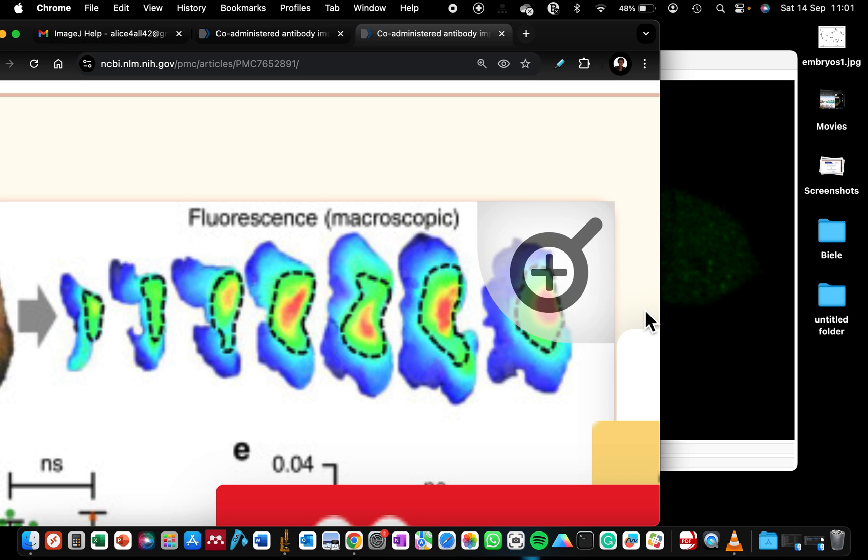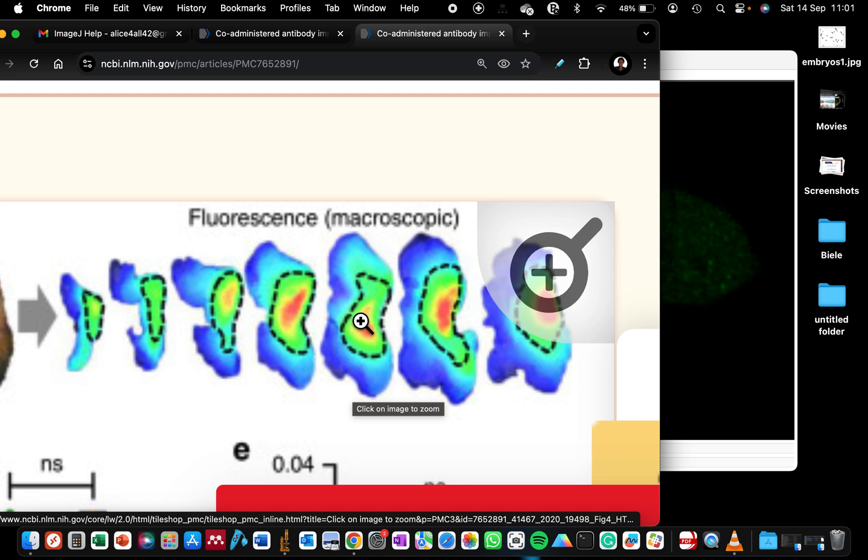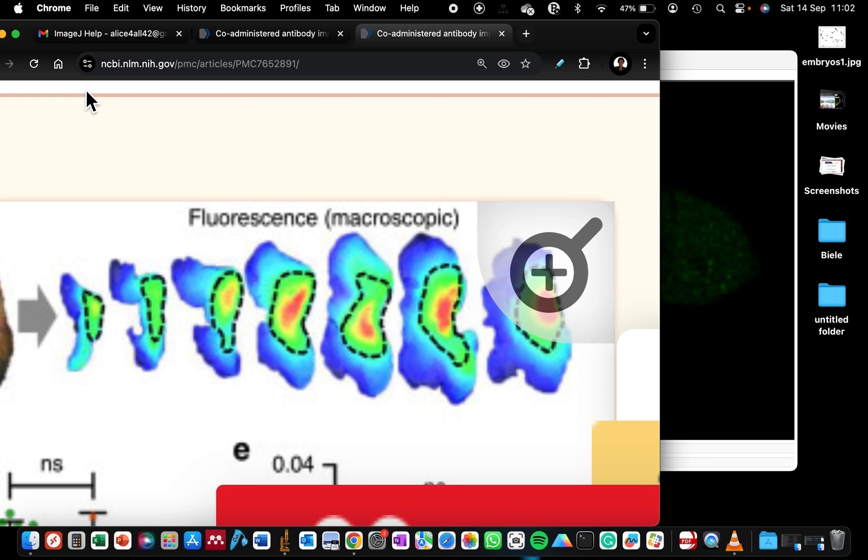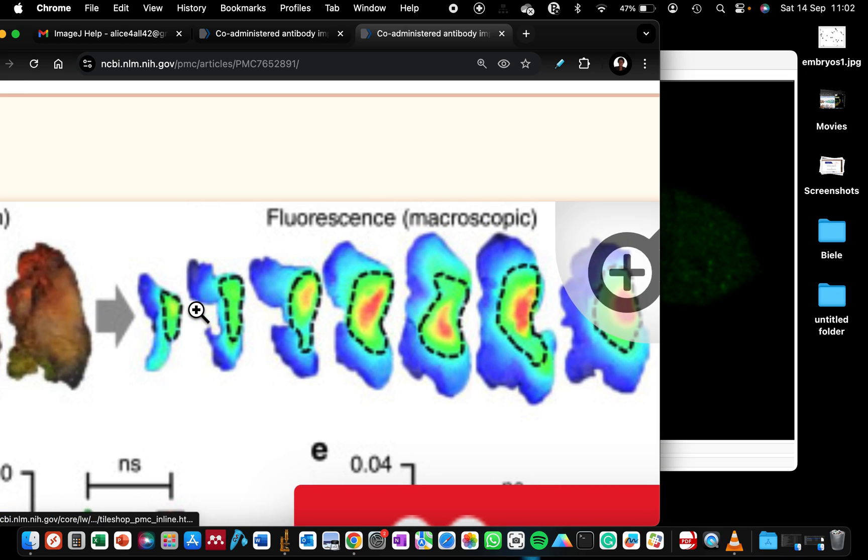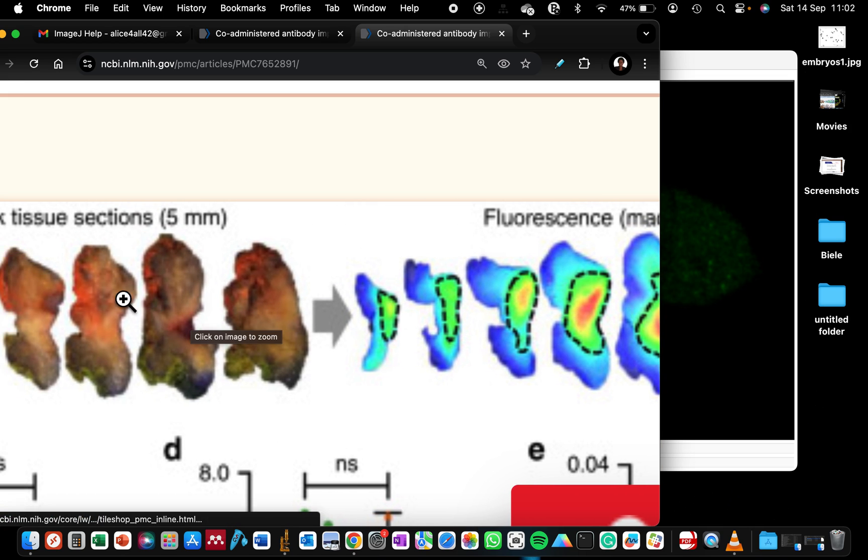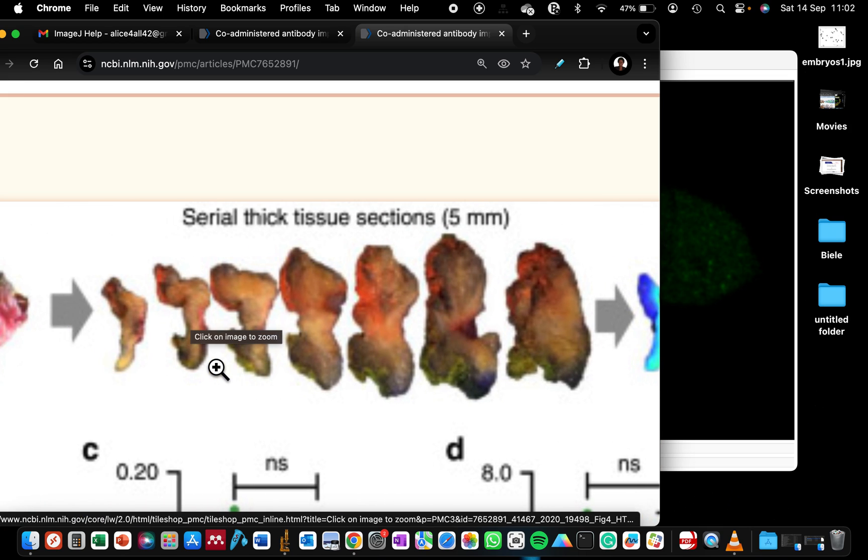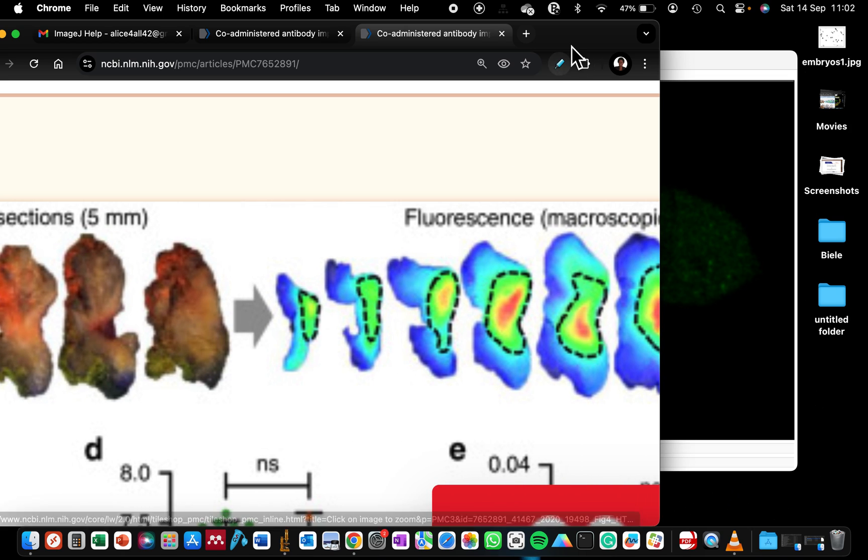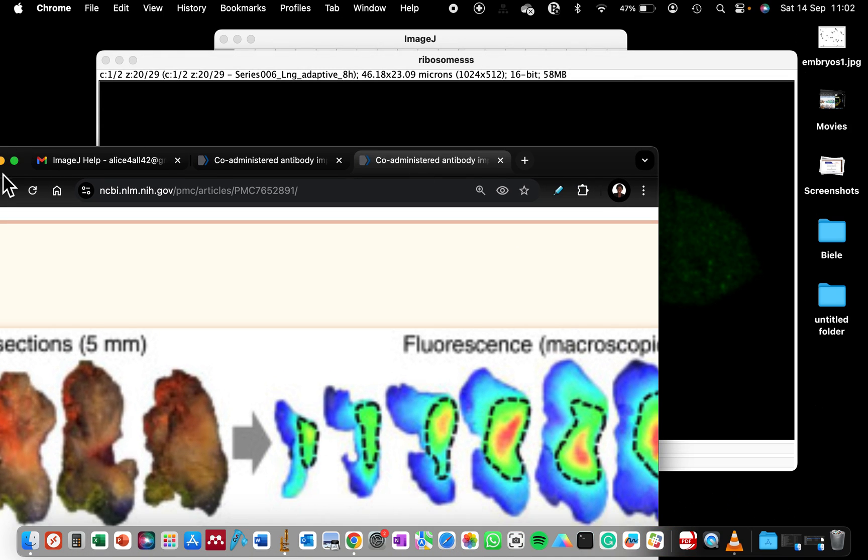In this video I will show you how to make a heat map representation of your fluorescence image or any type of image. In the first part I'm going to show you image processing using a fluorescence sample, and in the second part I will show you that you can also use non-fluorescence samples like this histology specimen.